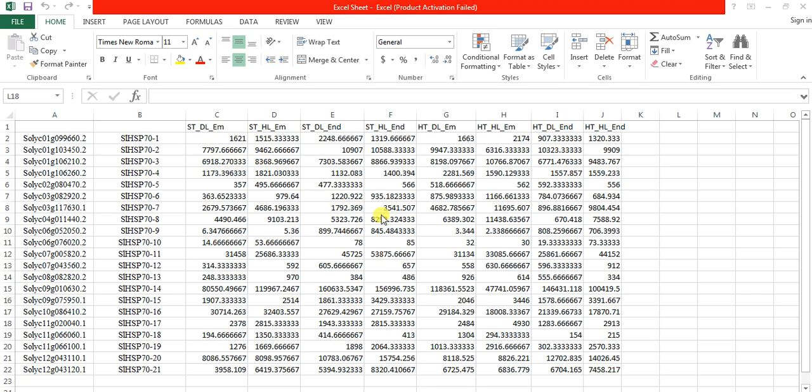I have taken their mean. Now you need to convert them into log2 values to normalize them, because here we see that the expression of this gene is 5.36 and here it is 33,085. So it's a large difference between these two values.